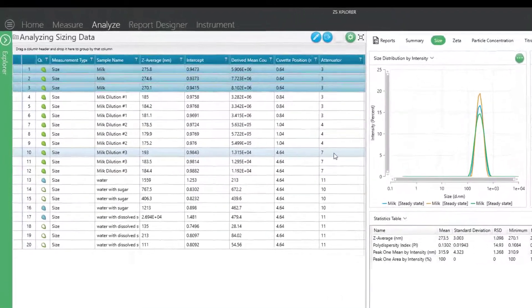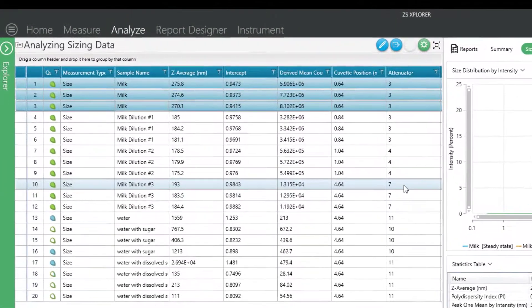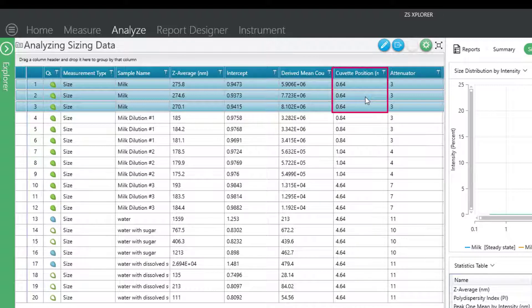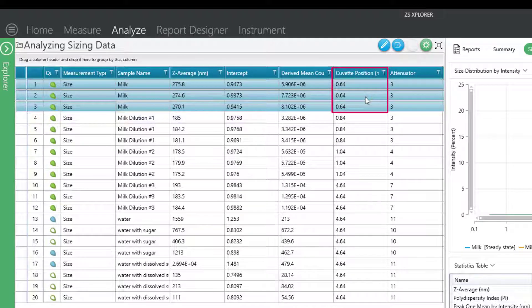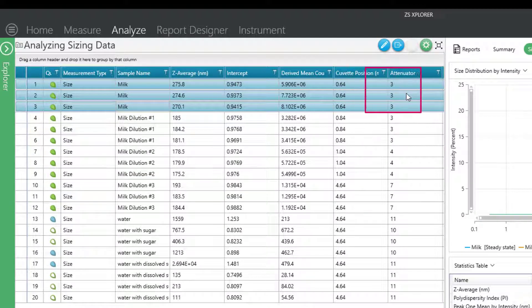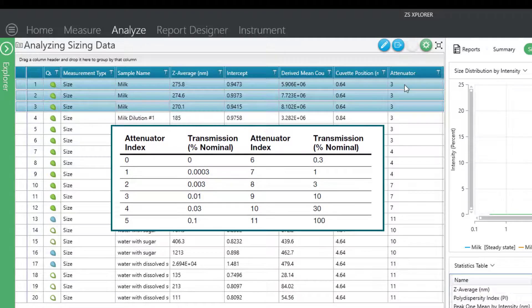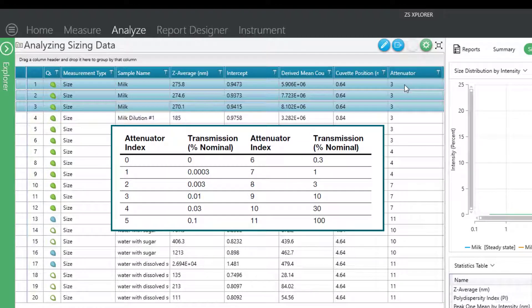Some of the parameters that you may want to look at are the cuvette position, if you're doing a backscattering measurement, and the attenuator. So the attenuator has 11 different positions. For full laser power, you would have an attenuator of 11. And the lower the attenuator value, the lower the laser power that we are using for your sample.